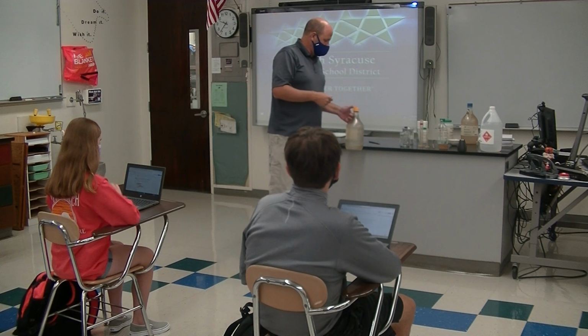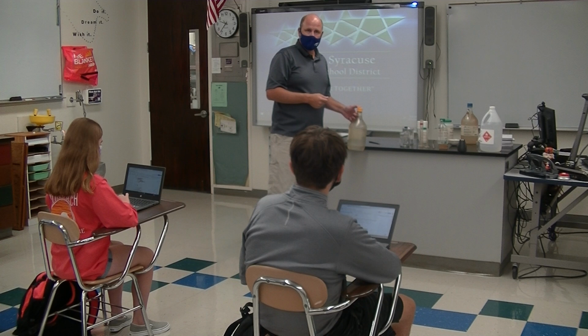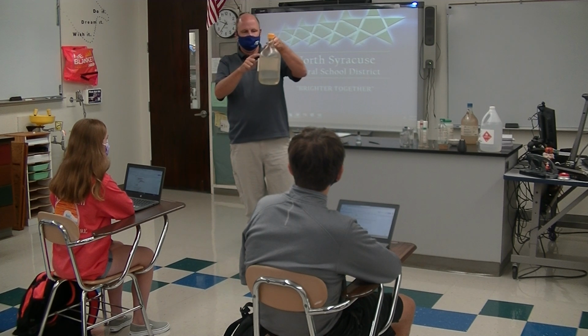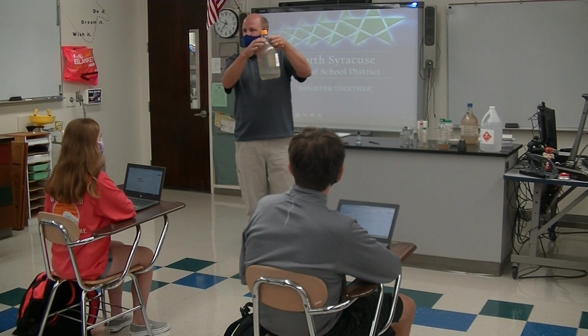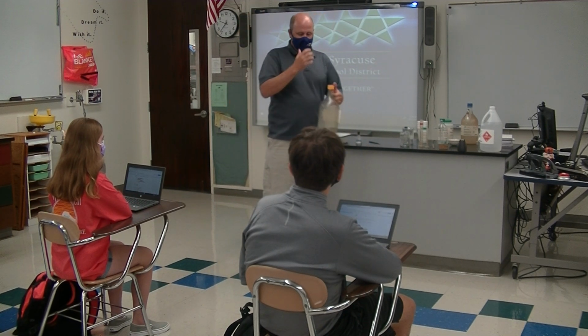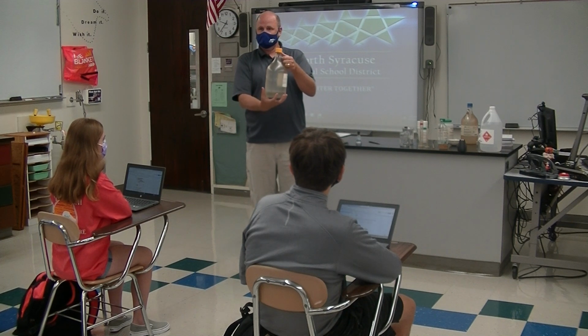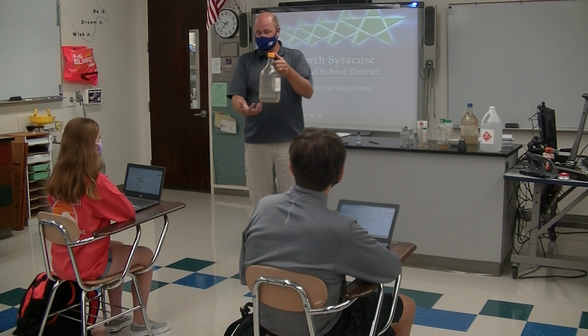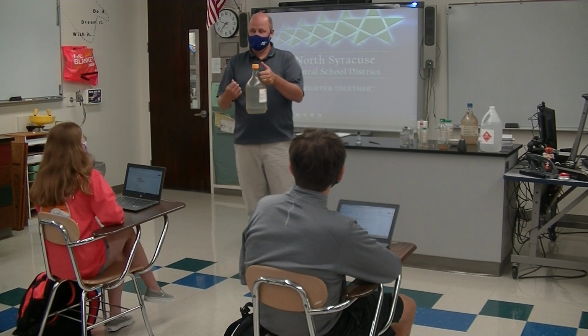and she went to put it on the counter and she hit the countertop. Now, this bottle's got a little, if you look at it, it's kind of like dusty. Alright, it's got a rubber coating on it, so that if I were to whack this bottle against here, this thing would stay encased. The glass would break, but the stuff inside of it wouldn't fall out. And then we get these bottles now because this happened at that one point in time.